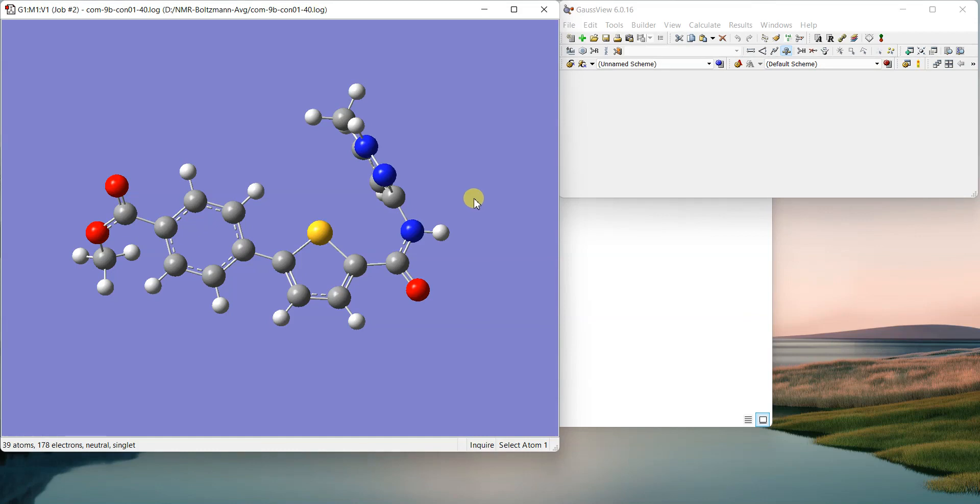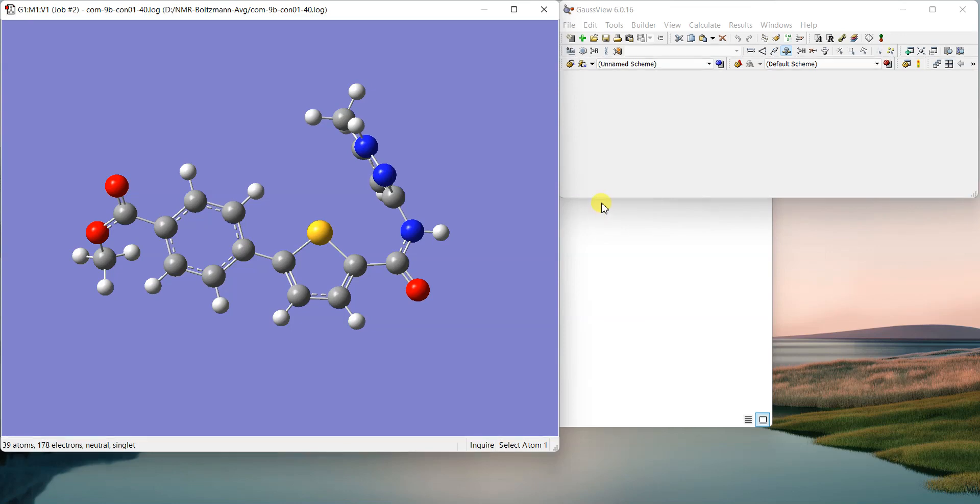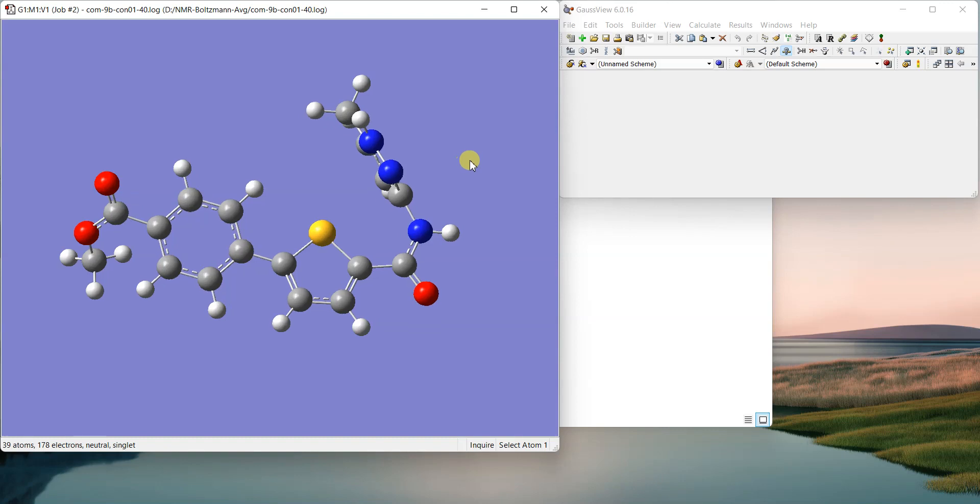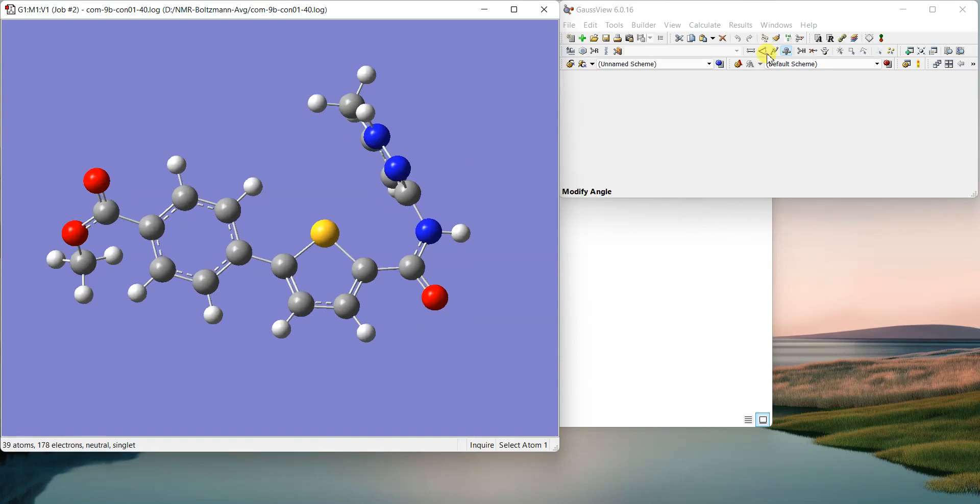When you have many different conformations, this is a very simple case where we have selected only six conformations. Sometimes you might end up with like 50 or hundreds of conformations of a molecule if the molecule is big and it has many rotatable bonds. Then in that case it is very difficult for you to write down the NMR data.